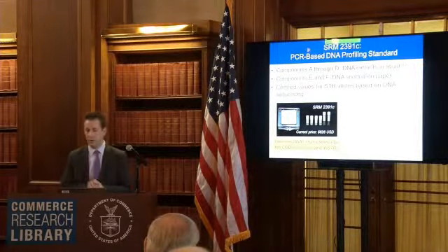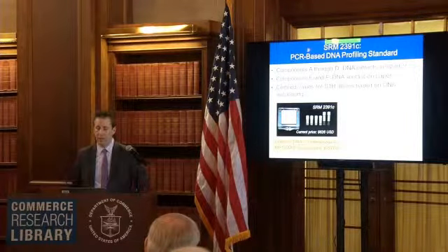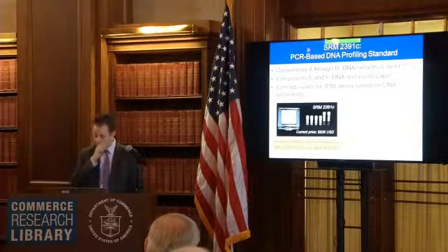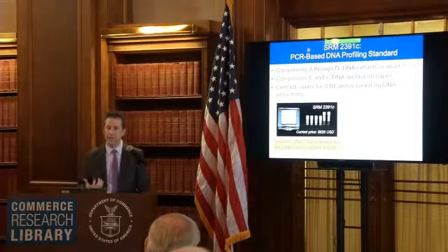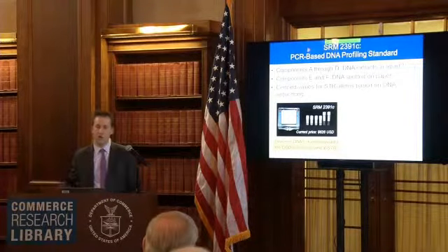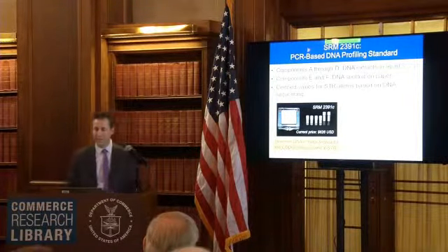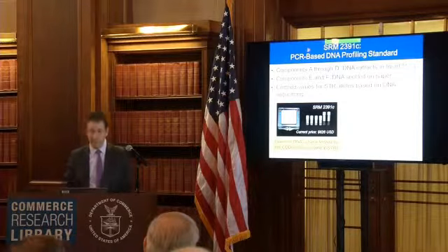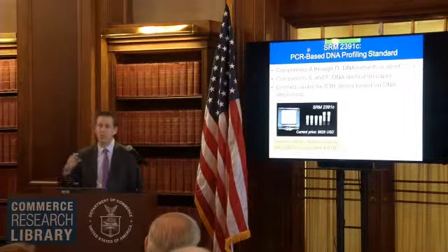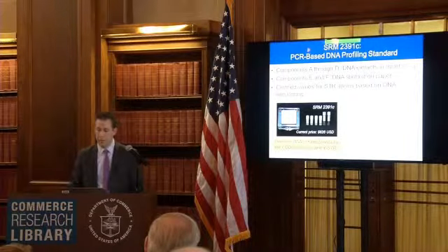Those are just liquid samples containing genomic DNA. And then components E and F are actually DNA cells that are spotted on paper if someone wants to do the extraction. And then what we've done at NIST, sort of our value here, is we took these genomic samples, we tested these on all the different markers and kits that exist for DNA typing. We've also sequenced them as well to see what those repeat motifs are, and that's what's in their certificate for 2391C.